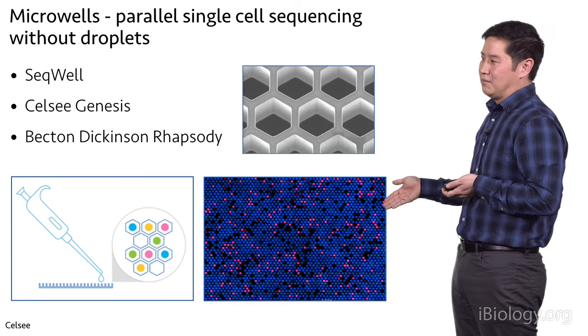This is essentially what the final library looks like. You have an RT barcode, or reverse transcription barcode. You also have two different barcodes that are in the Illumina adapters that can be used as well. So you can potentially barcode up to three times with this method. The power of this technique really comes in as you add more of these levels. For instance, if you had two sets of 96-well plates and you're barcoding them, you have almost 10,000 combinations. If you were to work with 384-well plates, you'd have almost 150,000 combinations. And it actually isn't ridiculous to work with several 384-well plates at each step.